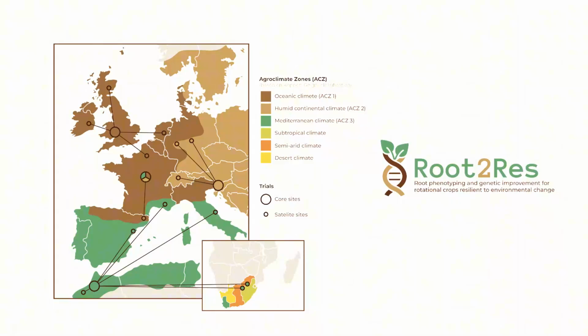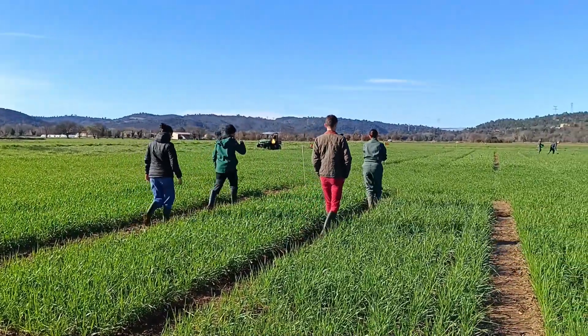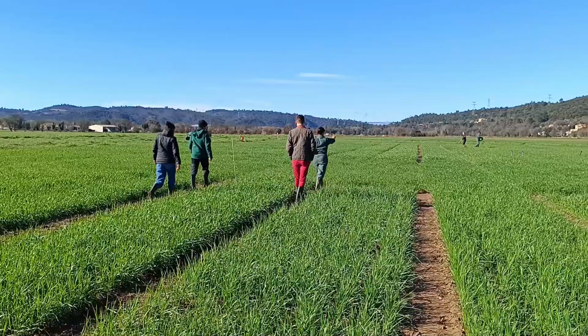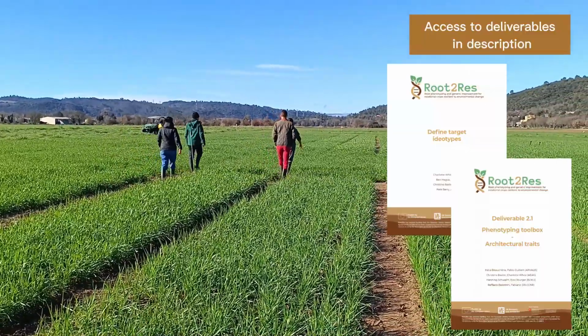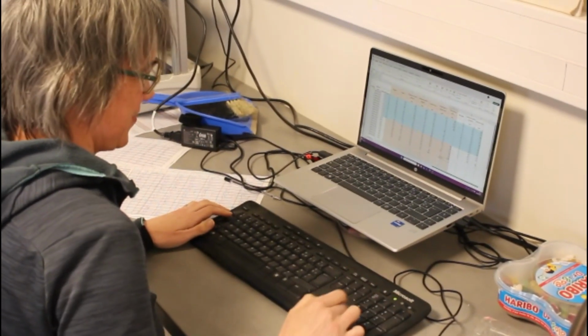We have deployed this method at key sites, representative of the 3 main agroclimatic zones in Europe, on spring barley and durum wheat trials. The results from the first year of experimentation allowed us to identify the most important traits for characterizing spring barley or durum wheat roots and to adapt the protocol for use on a large number of plots.